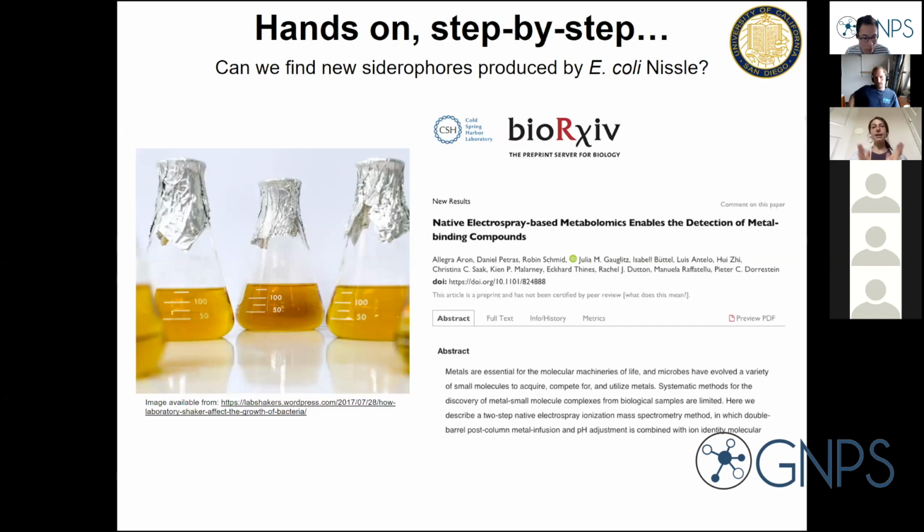In this workshop and the next two workshops following, we'll take you through how we actually did these experiments and the new technologies that we've developed.